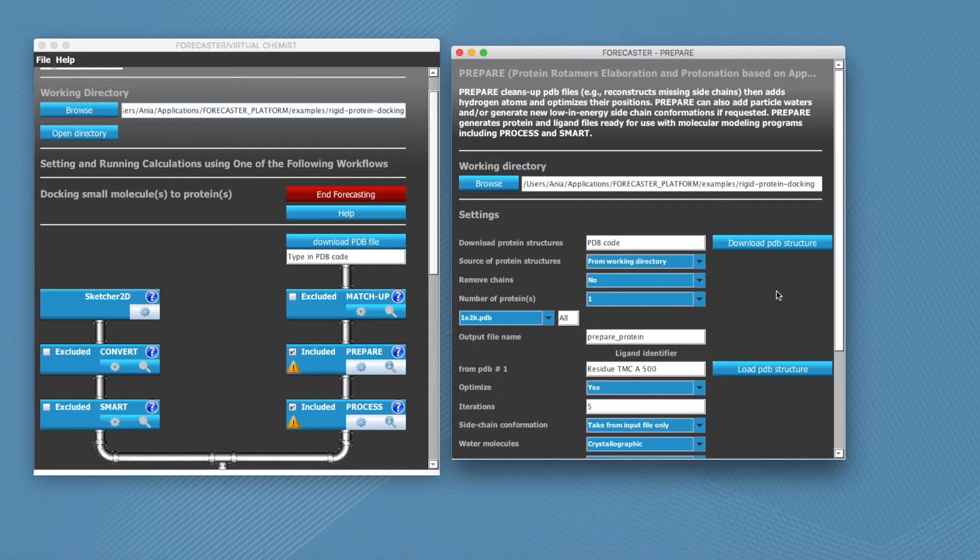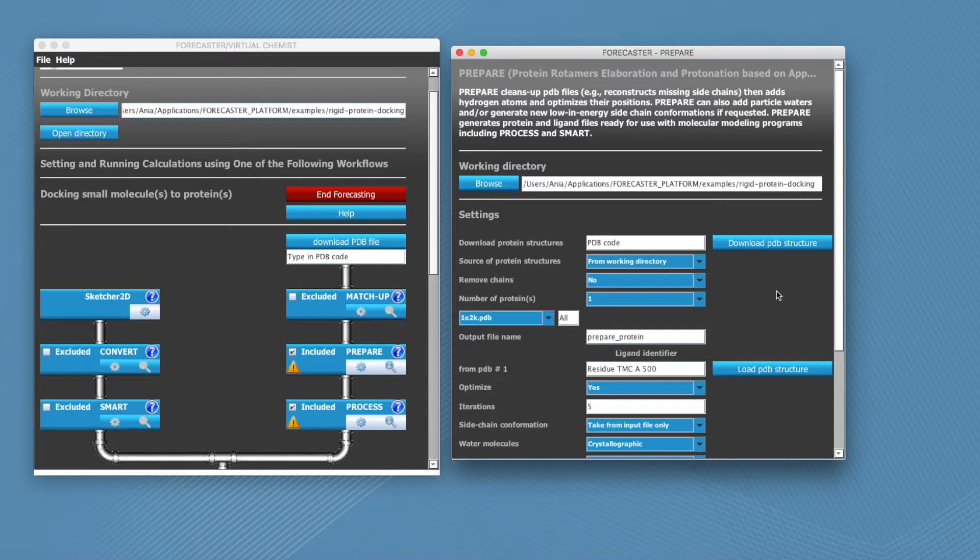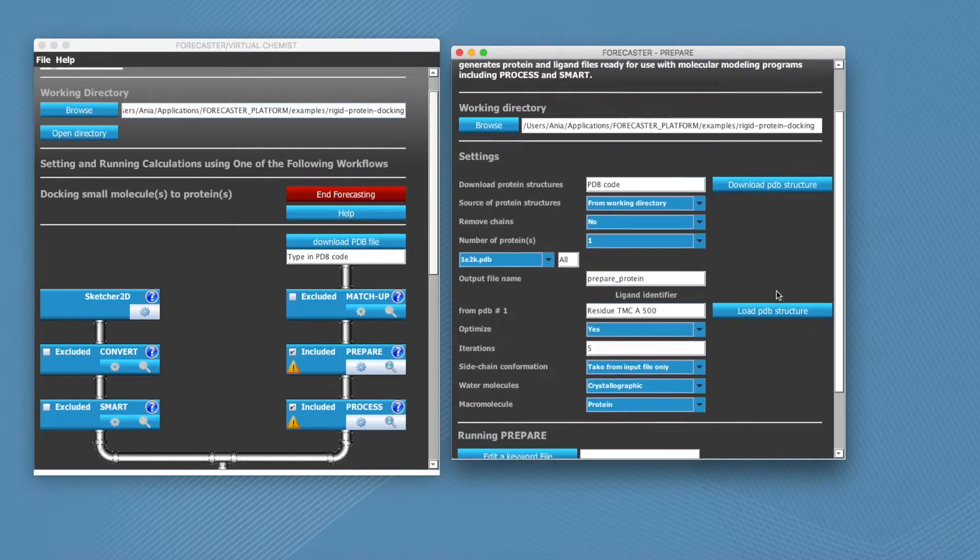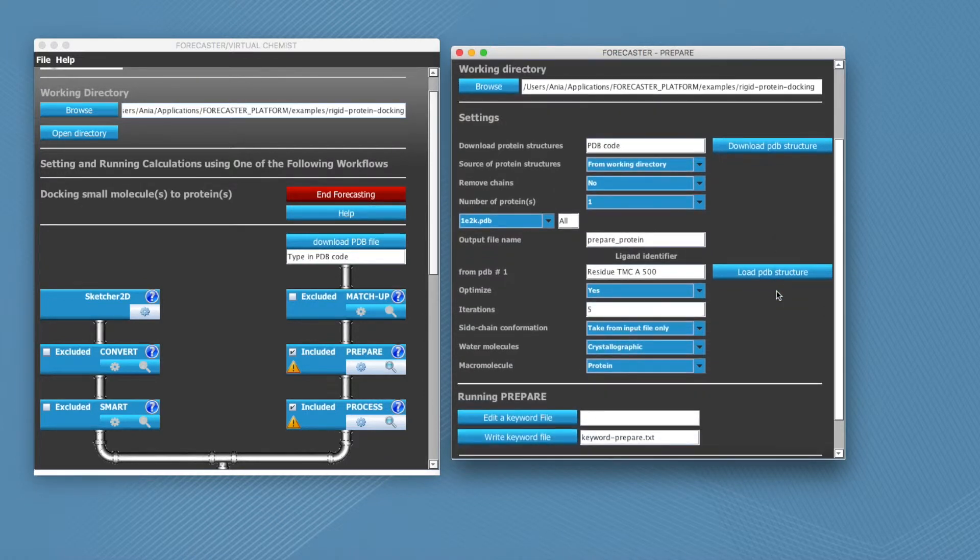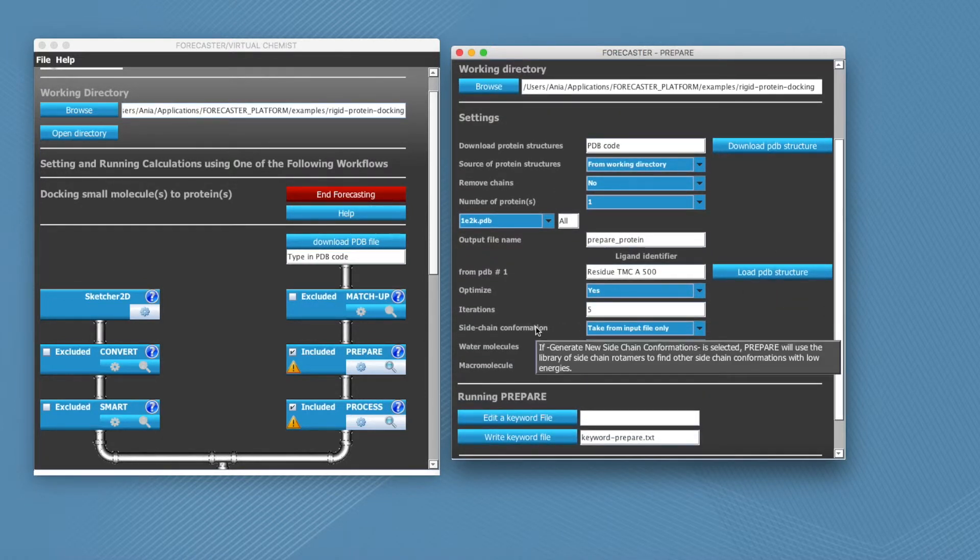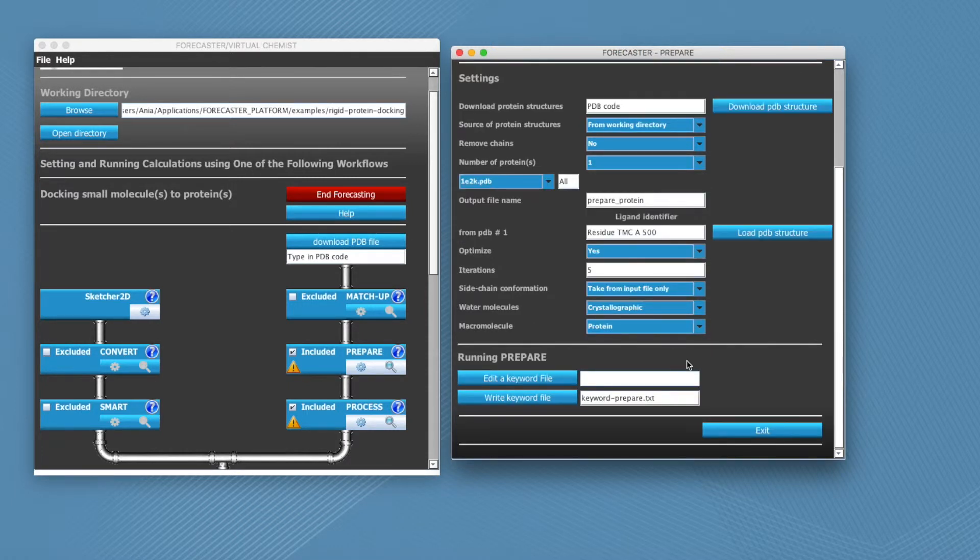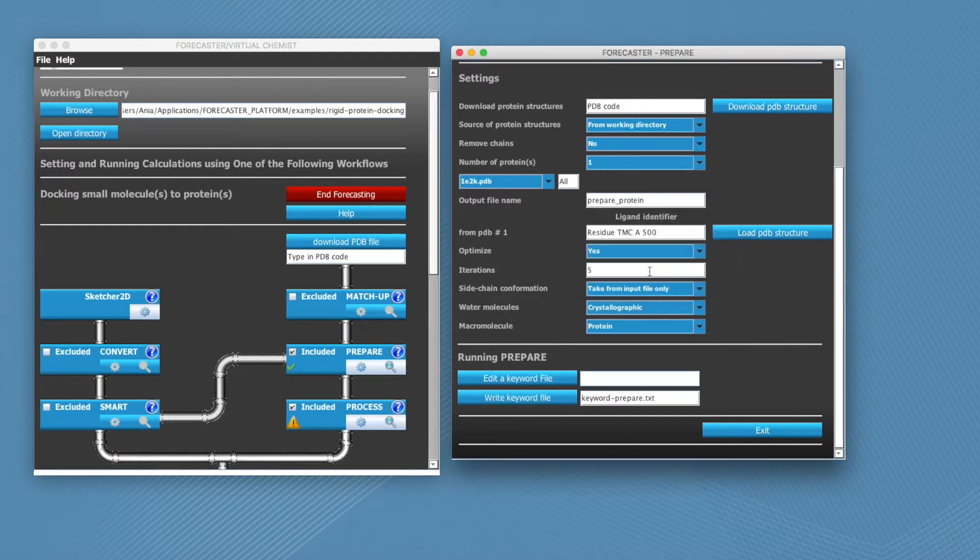The pop-up window will be mostly auto-filled with common defaults, however, you can easily tune them to better suit your needs. Hovering your mouse over an item will display a more detailed explanation of the parameter. When you're ready, hit write keyword and exit.